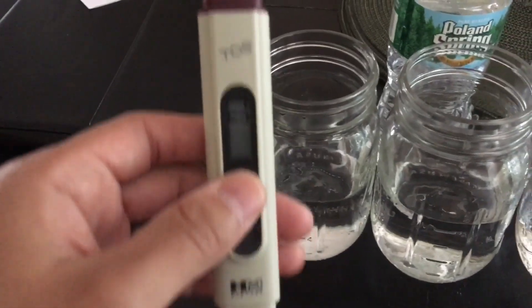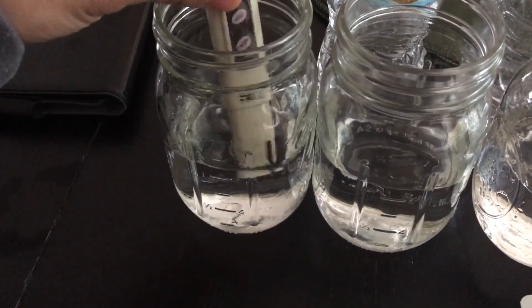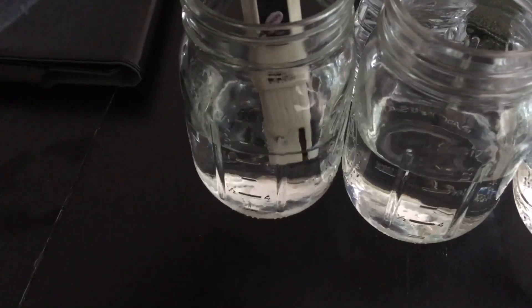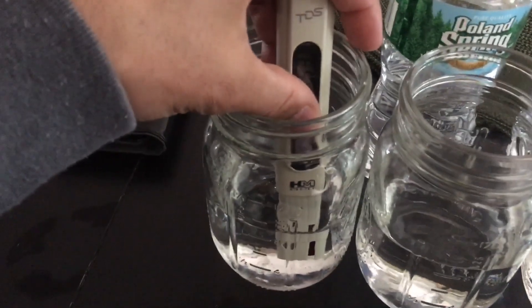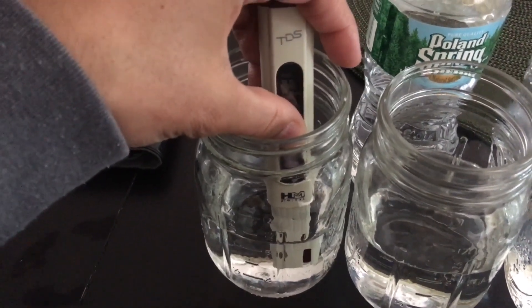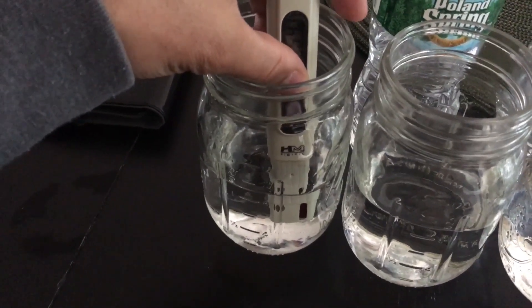So here is my municipal water. I go ahead and put the meter in — you want to make sure to insert it a decent amount and hold it in there for at least 10 seconds or so. I'm fumbling a little bit because I'm using one hand, but trying to press the hold button so I can show you the reading.